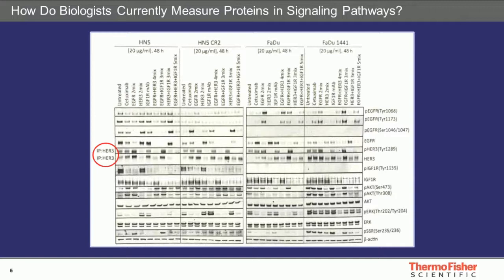Researchers have been using Western blotting techniques and similar techniques as they are helpful for monitoring very discrete changes in the proteome, but it is a lot more challenging to observe small changes related to post-translational modifications that may be more subtle or are substoichiometric. So analytically, the variability of the reagents, particularly the ones that are raised against post-translational modifications or modified proteins, plays a very big role in the confidence of the results at the end.